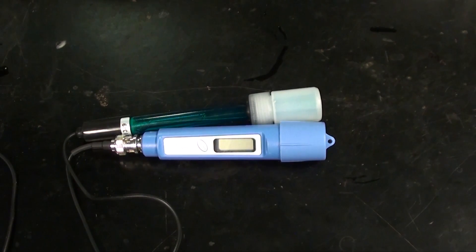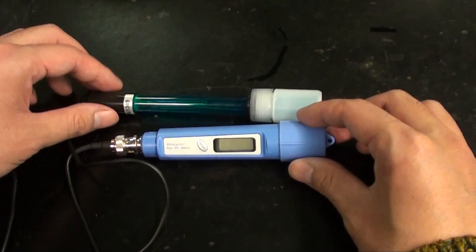Another company that sells a broad range of pH meters at various price points is Omega Engineering. I put the link in the video description. Now let me show you its components.